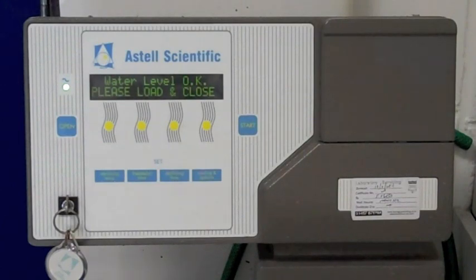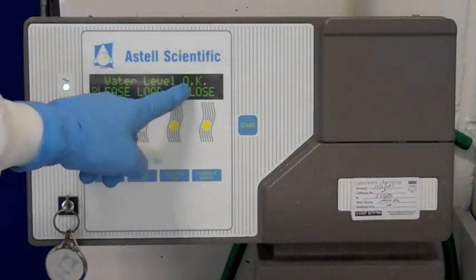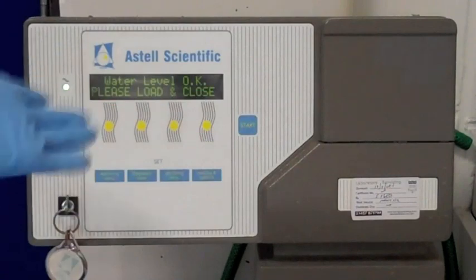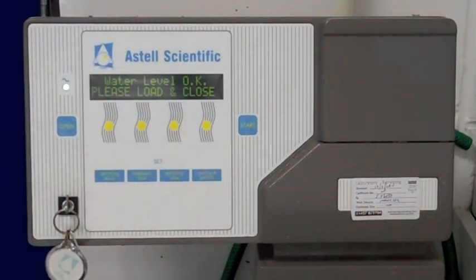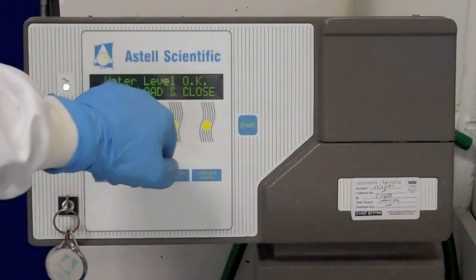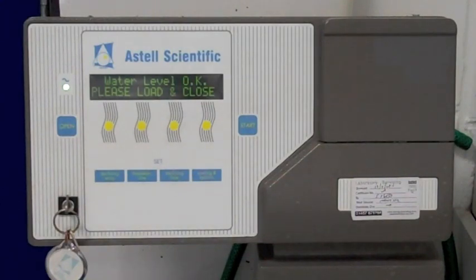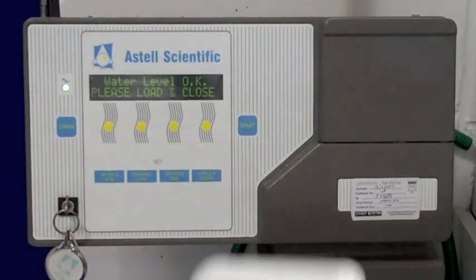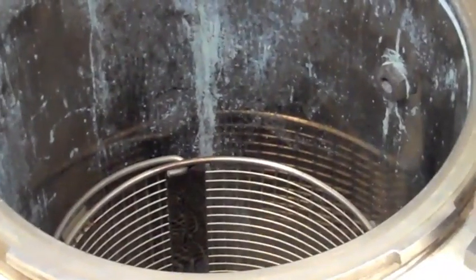You can see that at the moment the setting says water level okay, please load and close. That now means that the autoclave is actually ready for use. If the water level said water level low, you would simply add some tap water into the main bowl, into the main part of the autoclave, until the settings said water level okay.